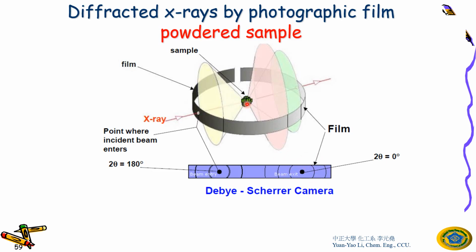Because a polycrystal is regarded as many small grains together, and then it's isotropic, right? It's not anisotropic. We just learned this.